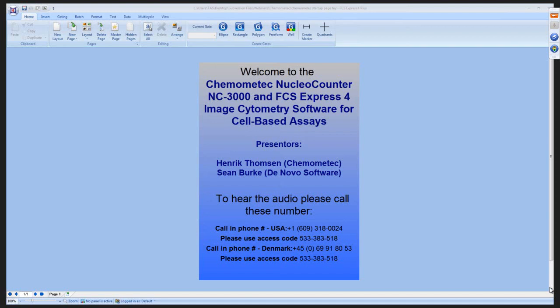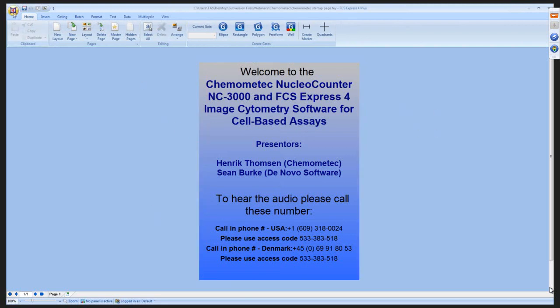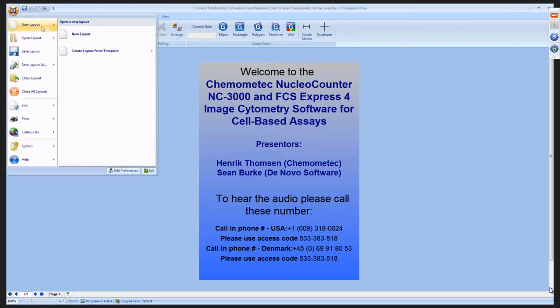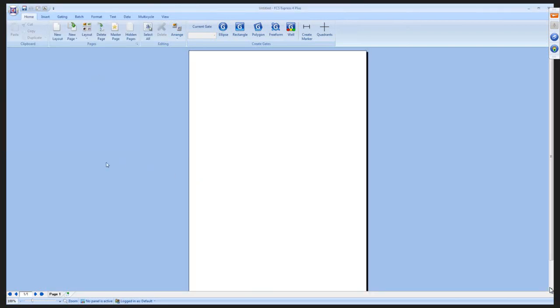So right now you see on the screen we have a welcome to the webinar screen here. But what I want you to notice is that we're actually in FCS Express right now. And if I come up to what we call our Applications button and insert a new layout, you'll notice that we have a blank page here. The whole idea behind FCS Express is that it looks and acts just like Microsoft PowerPoint or Microsoft Word or the Microsoft Office suite of products.